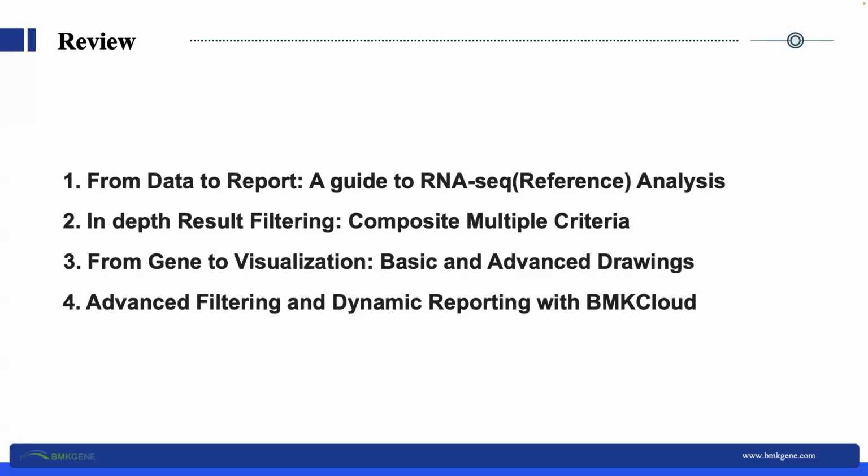You can customize your visualization results, filter gene sites by multiple criteria, and add groups or delete samples using BMKCloud. And in the last webinar, we used published data to do a real transcript analysis with a reference genome. Here are the material and our main goal.